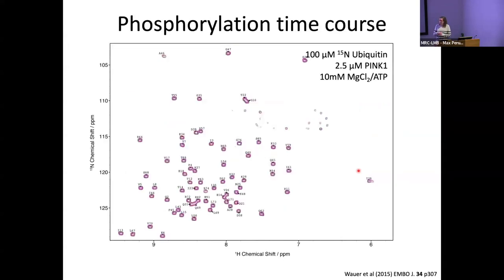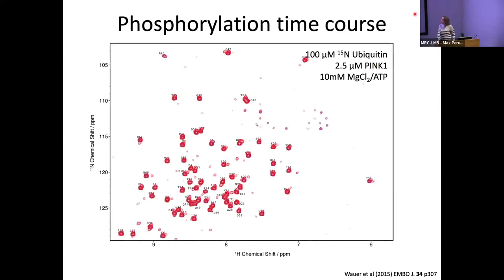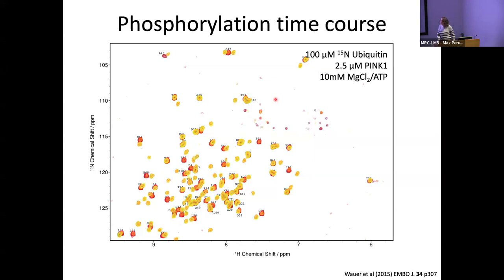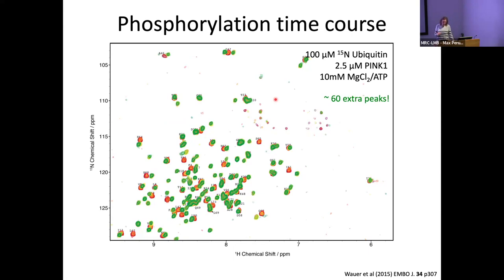Here's wild type ubiquitin with serine 65 highlighted. With a time course of phosphorylation — collecting one HSQC every seven minutes — we can see serine 65 disappearing and extra peaks appearing due to the change in chemical environment. At the end, serine 65 has completely disappeared, which is what we'd expect. But interestingly we actually had 60 extra peaks, and we didn't really understand what was going on, because you should lose one peak and gain another.